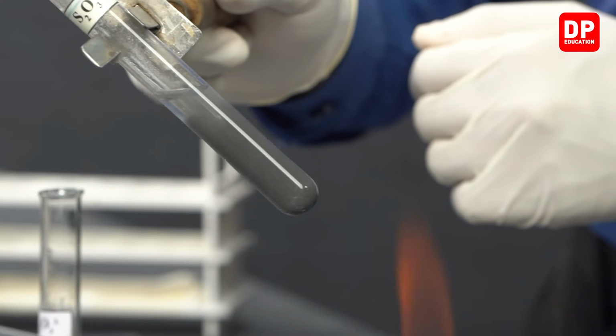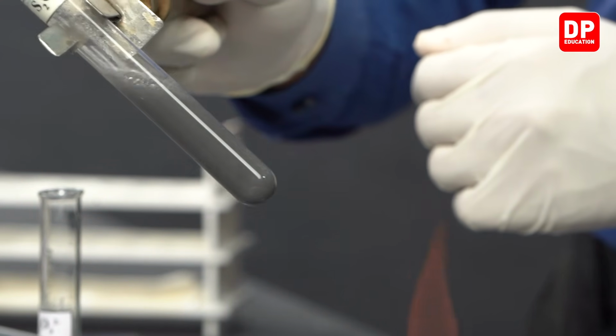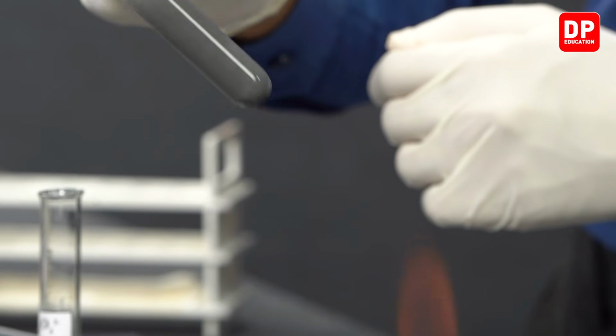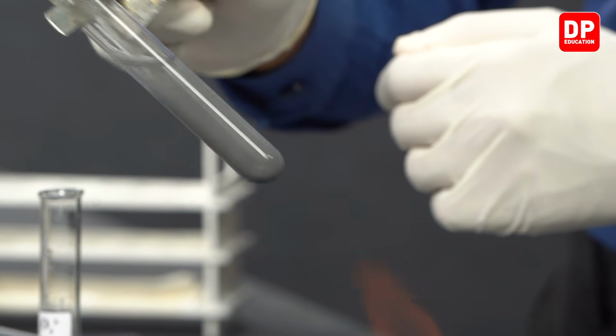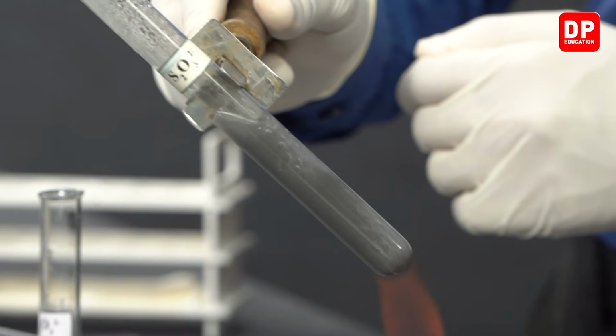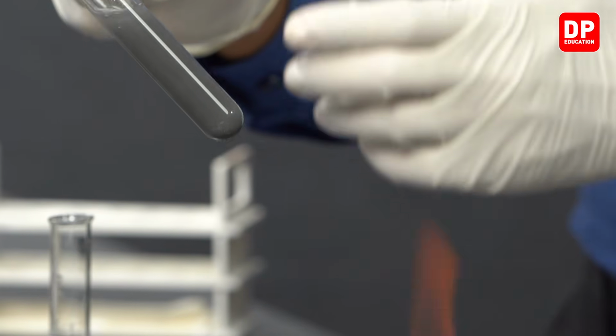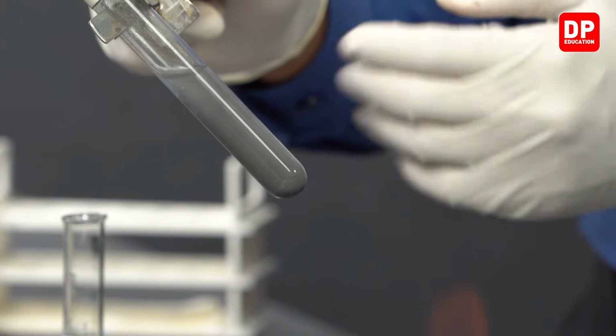So to avoid that from happening, make sure that you heat it gently, and as you observe that the solution is boiling, you can remove it from the heat and you can continuously boil it over a period of time, making sure you don't allow the solution to boil over.